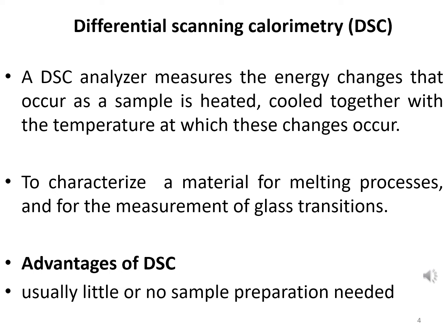They can be easily placed in the DSC analyzer, so that measurements can be quickly and easily made, because there is no need to prepare a sample for differential scanning calorimetry. So it can be readily placed in the DSC analyzer and quickly measured or analyzed.